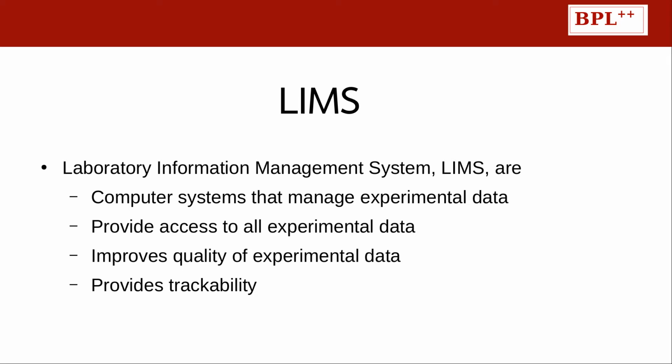The use of computational systems can help overcome the main problems found in such an approach, such as data overload, difficulties in data retrieval, reliability, and traceability. Laboratory Information Management Systems, or LIMS, are one tool that can assist in this task. LIMS are computer systems that manage experimental data. They store data from each experimental step, providing access to this data and also relating these steps. LIMS provide trackability of experiments, allowing users to identify which steps are related to which other steps, improving the quality of the experiments.